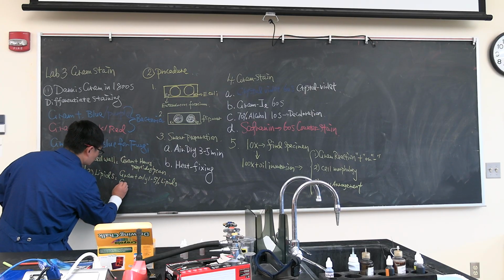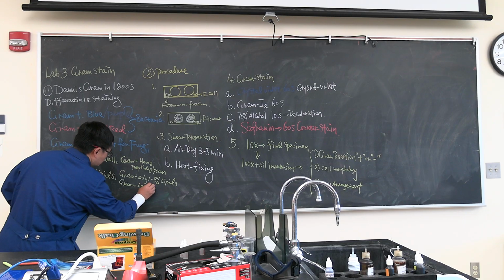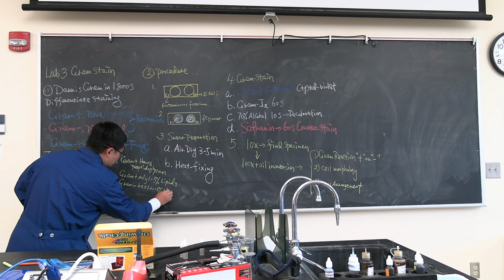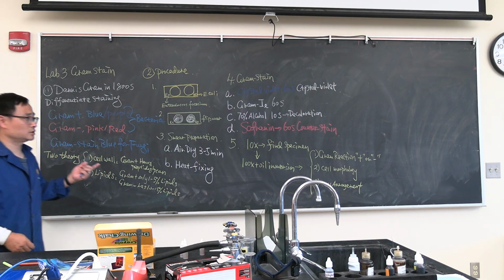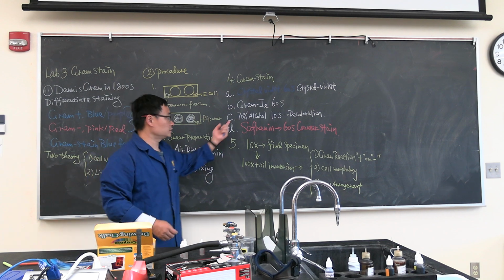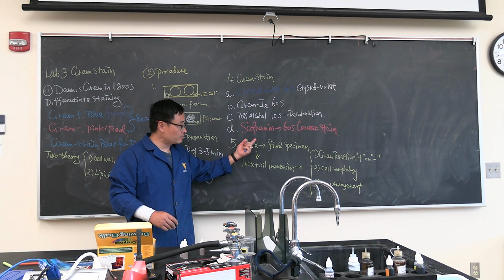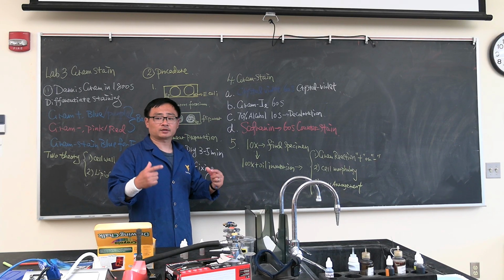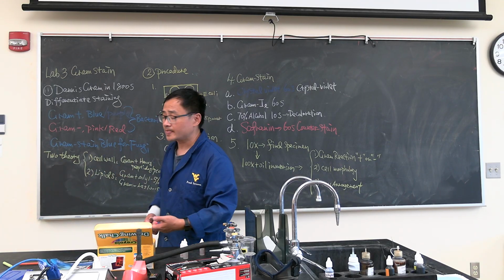In contrast, gram-negative bacteria have 10 to 15% lipids. So during the decoloration process, the lipids are dissolved well in the alcohol and all washed off. At that moment, ideally the slide should look blank. Then you counterstain with safranin, and it shows a pink color.